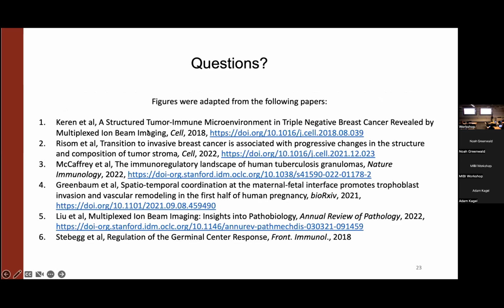Yes. Have you tried running this on a tile? What do you mean by a tile? Okay, so you want to randomize the labels across the different FOVs? Yeah, so essentially, instead of doing it per FOV, you would tile the FOVs and randomize. I mean, potentially, if you have your delineated section randomized across FOVs.